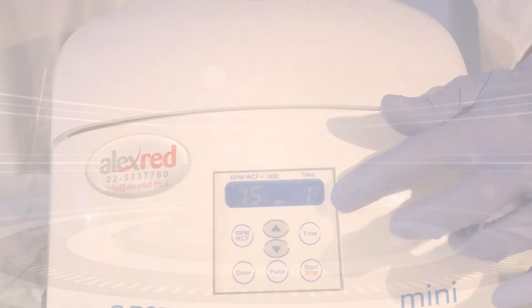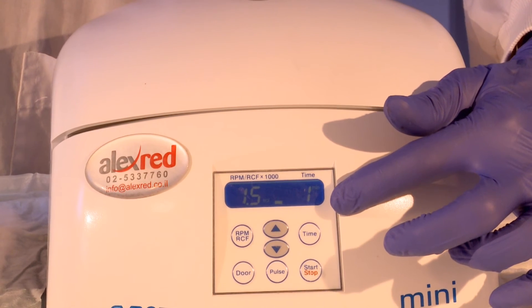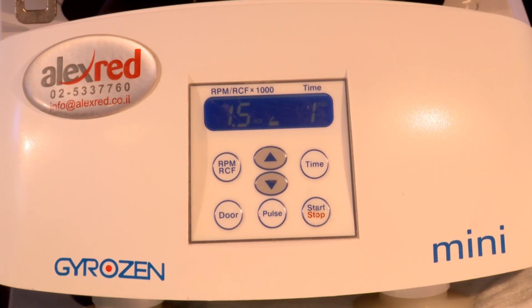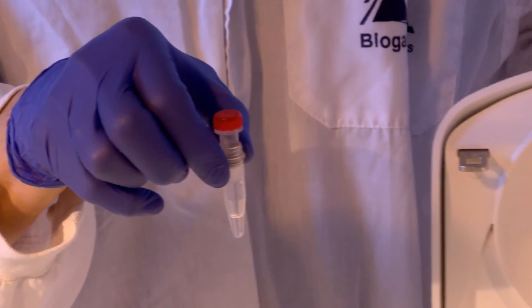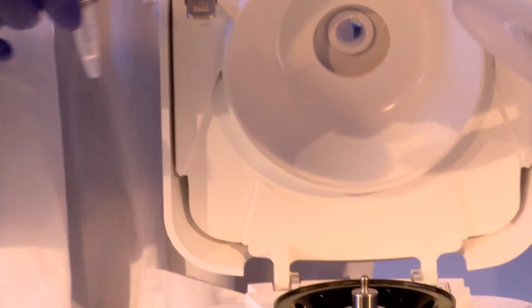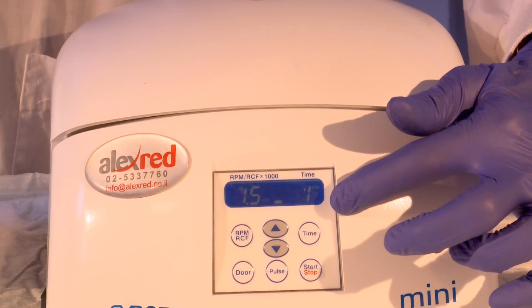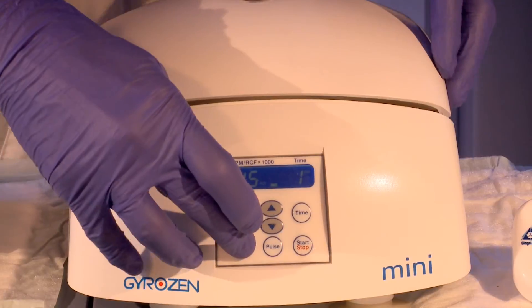Centrifuge method: This method requires a centrifuge which can contain the green-capped vials and maintain a speed of 1500g for one minute. Place both the column and the green-capped vial piggyback into the centrifuge. Activate the centrifuge for one minute at 1500g.